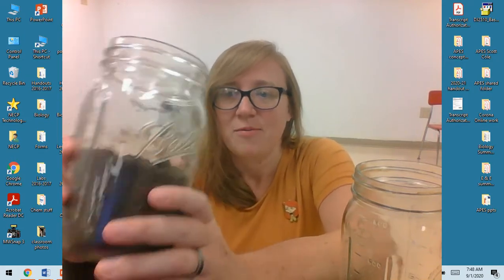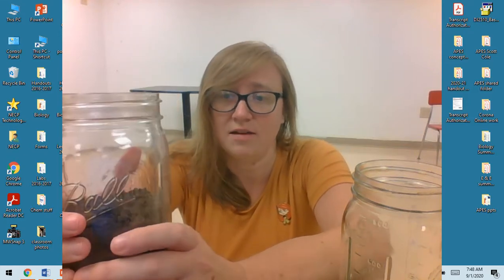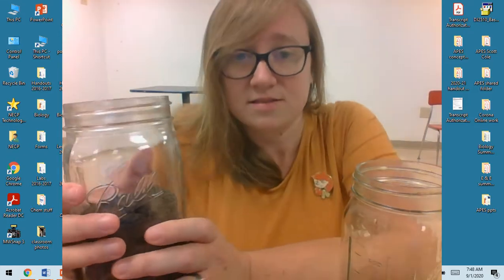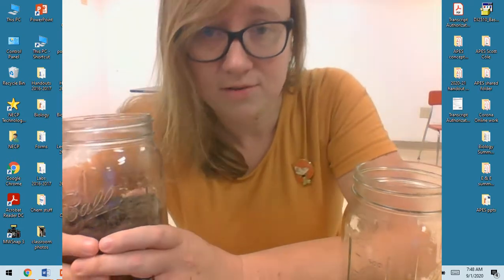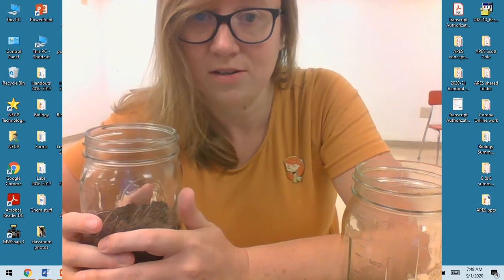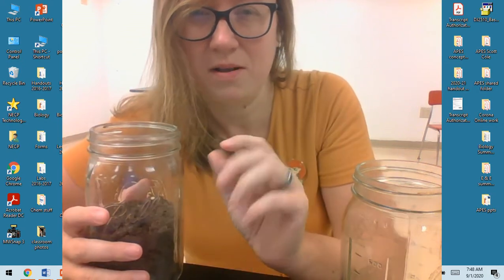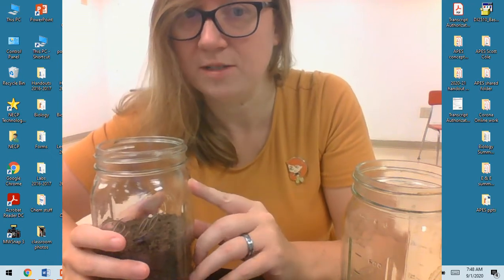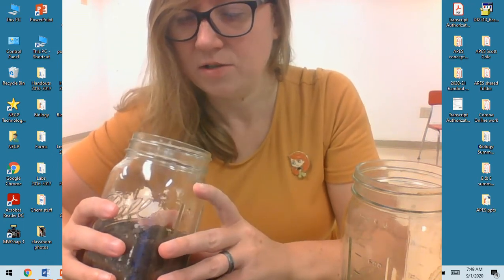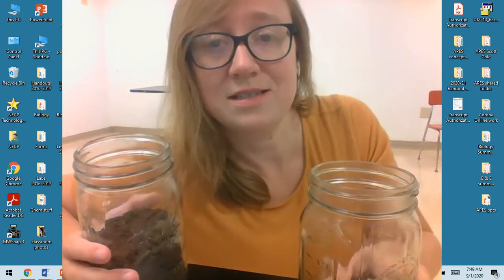But so when you get your soil, you can go outside. I did not dig where there was grass because you'd have to dig through the grass, and then you're going to have lots of roots and leaf litter and material. And it's okay to have some organic material, but we want to minimize the amount of organic material that we have. So one thing you can do, if you have something that you can use to sift your soils, you can sift it.